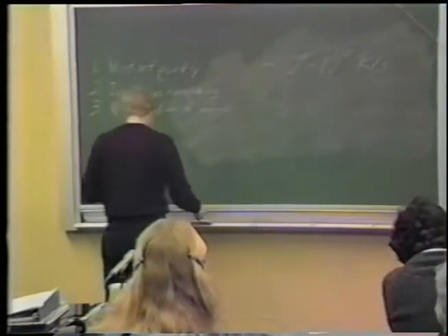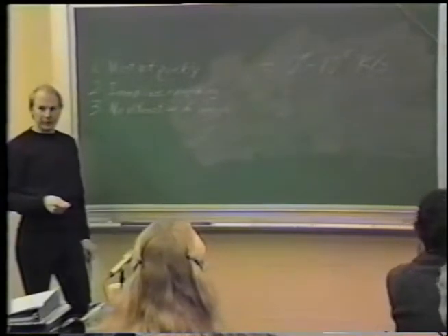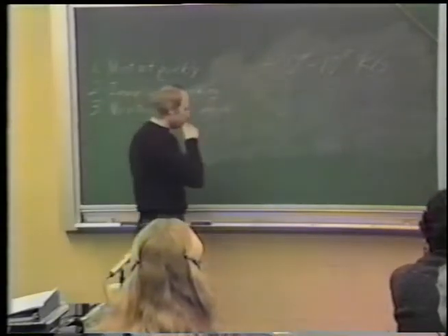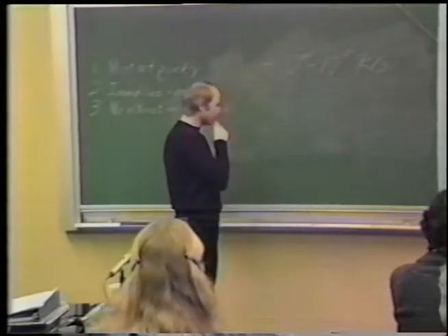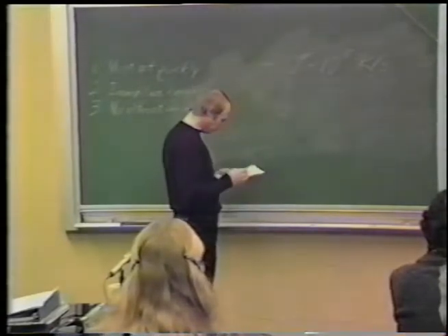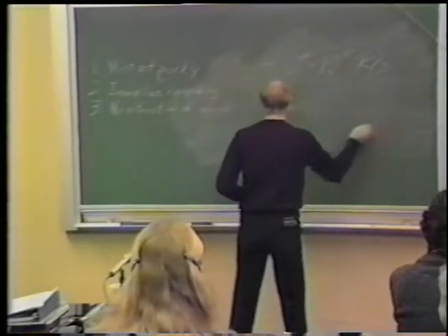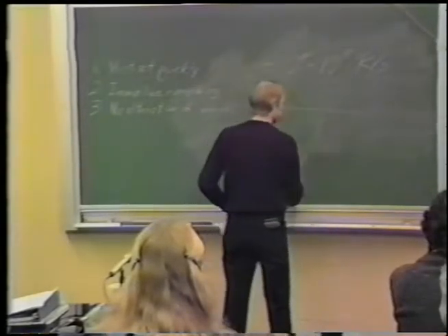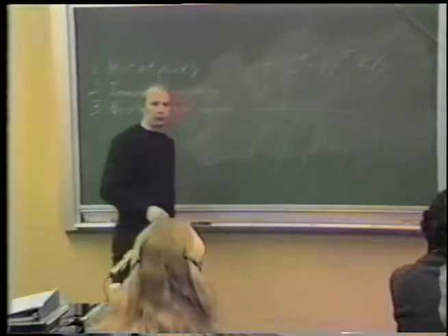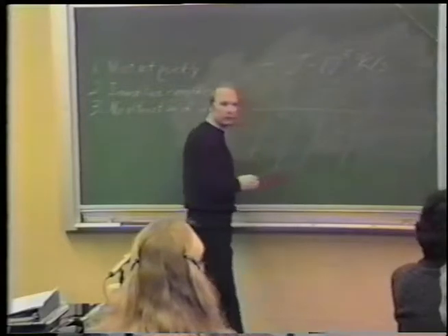Now, there are some effects of sample and cooling geometry on the probability that you'll be able to attain ultra-rapid freezing. Say here we have a large sample. At present, the only means we have for ultra-rapidly freezing samples is by withdrawing heat through the sample surface.